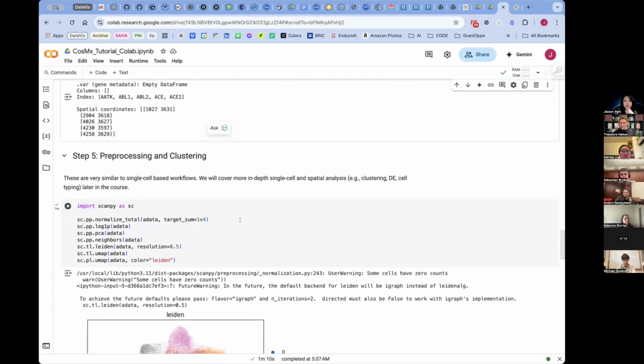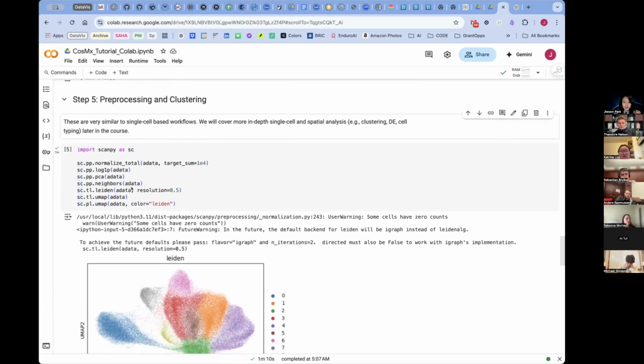So typical pre-processing of spatial or single cell workflows involves normalization, dimensional reduction, and visualization over UMAP for cell typing, further annotations, and feature extraction. This is worth another round of lectures, so I'll try to explain and guide you through the homework too, which is more focused on single cell and spatial analysis. But how many of you have done a scanpy single cell workflow or spatial?